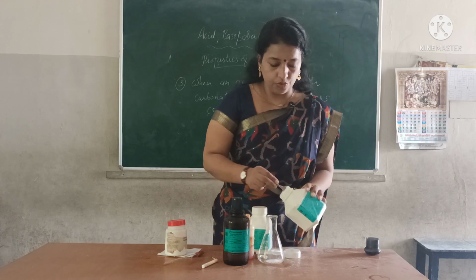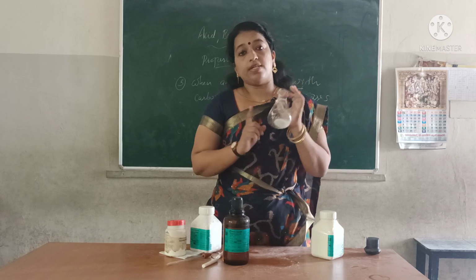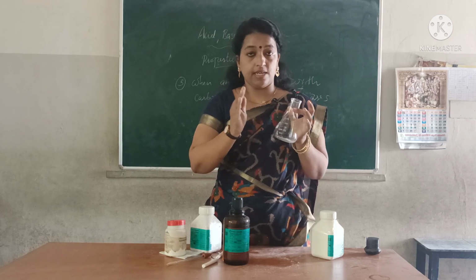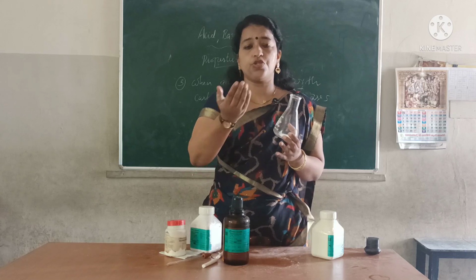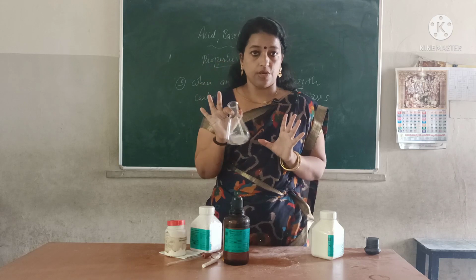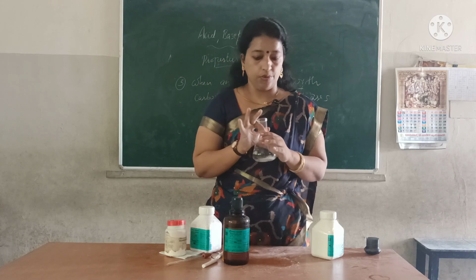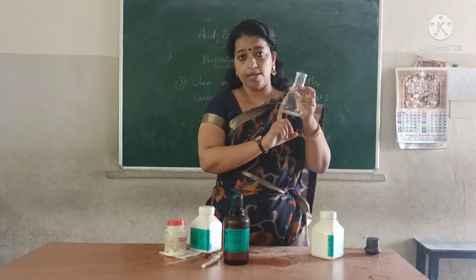Sodium carbonate into the conical glass. So actually in your textbook, it is the activity done in the test tubes, right? Now just to show you, I am doing this activity. I have taken one conical glass only, but in the textbook you have to follow test tubes.